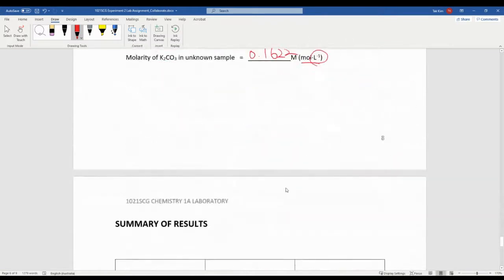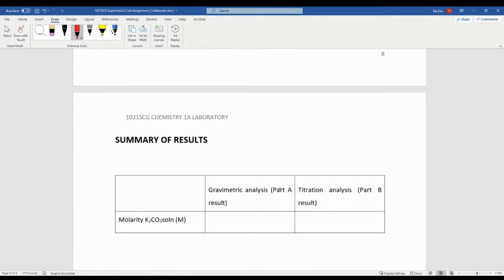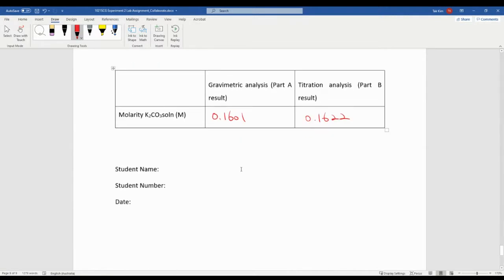So in the end, you will need to state the results from part A and part B. And that is all you need to do, right? Once you finish calculating and put the numbers in and save, you can use either the MS Word file or the PDF format, which I also have, but PDF might be a bit tricky because it is prepared as a form, so you will only be able to put numbers.